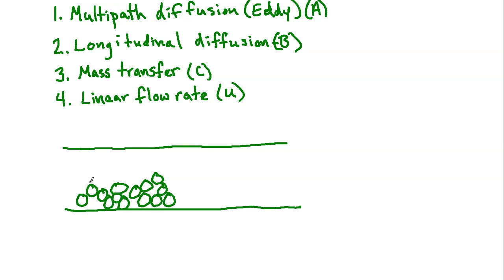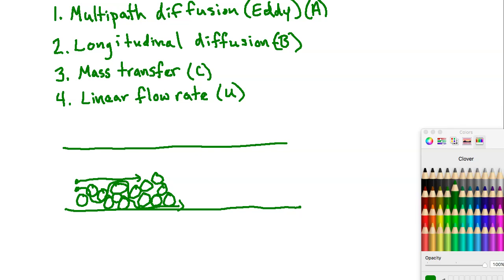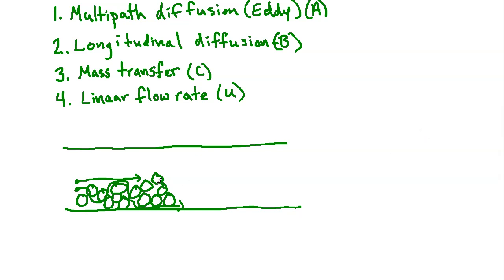If you were to look, analytes that are coming through in a band could take different pathways, right? So you could have an analyte that goes through the top here. You could have another one that goes underneath and then above this area, comes out here, goes all the way underneath here, and then arrives here. You could have another one, let's change the color just so it's a little bit easier to see. We'll use blue here, okay?